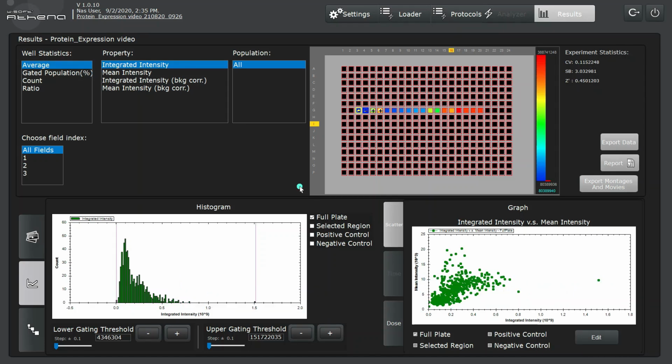In this video, we will describe the results screen for exploring the data extracted during image analysis. There are two ways to access the results screen. Firstly, it appears following image analysis of a dataset, which is what we can see now. A separate video will demonstrate exploring the raw images by accessing the results screen with a second method, which is directly clicking on the Results tab at the upper right of the screen.